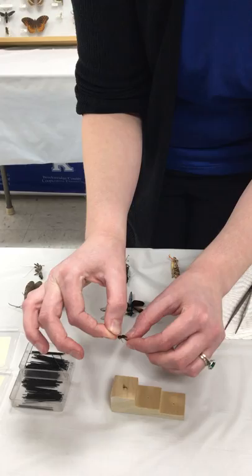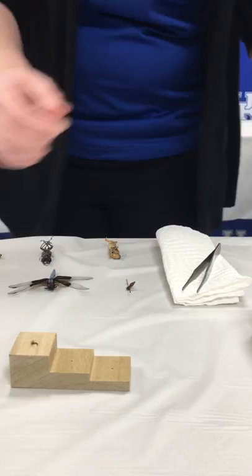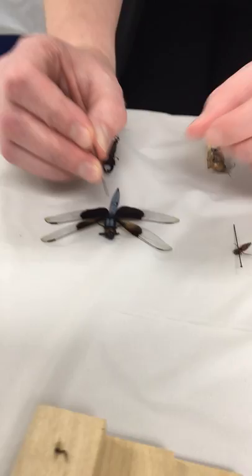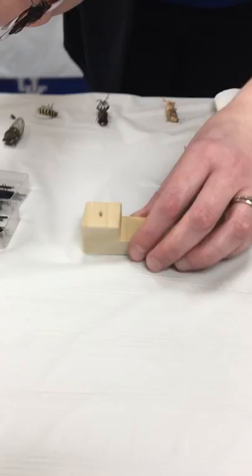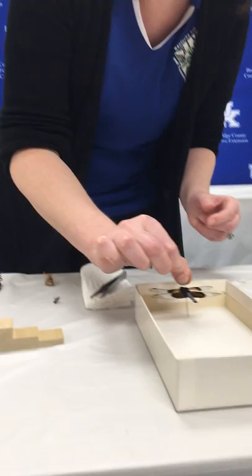I didn't get it straight in the middle and I lost one of my legs — this just takes practice, there's a little bit of an art to it. Our next specimen is a dragonfly and I'm going to pin it in the middle as well, getting it at the right height. Then the rest of the specimens we're actually going to pin a little off to the right.